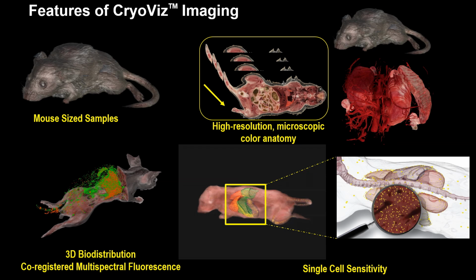The analogy I like to use here is a Google map that we use every day. Doesn't real utility and insight come when we're able to zoom in on elements on that map and learn more? Well, we believe the same holds true for research imaging.